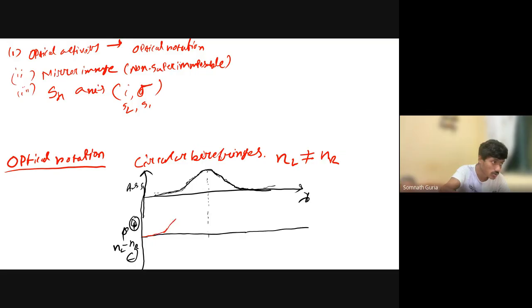So this is the optical rotation value, not the CD.